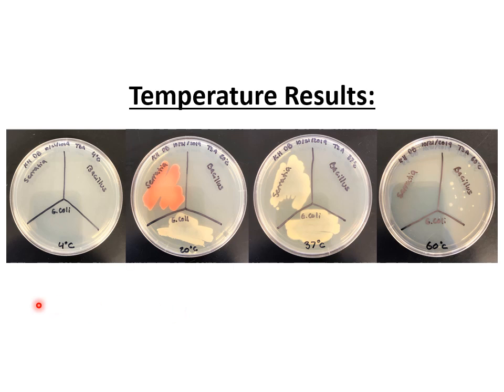And on each one you'll be able to see whether or not there's growth for Serratia, Bacillus stearothermophilus, which is over here on each of the plates, and then E. coli on each of the different temperatures, okay? So when you see a plate like this, you can clearly see no growth versus growth, growth, and growth, okay?